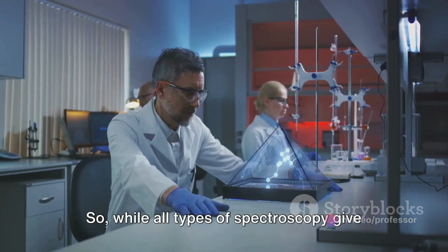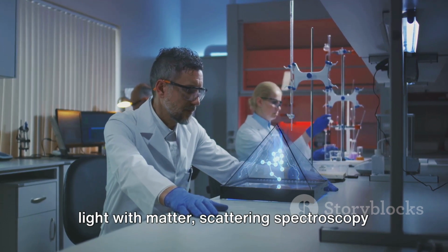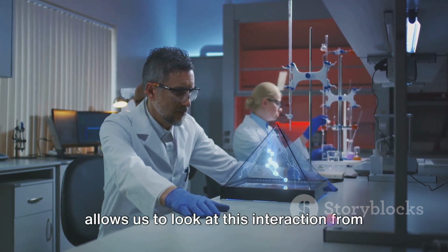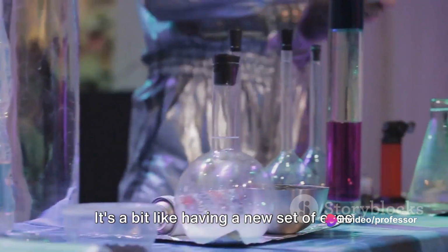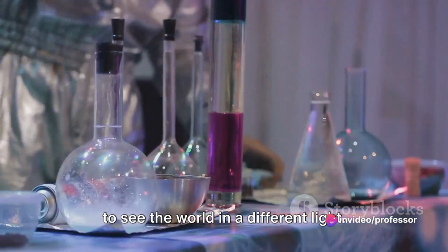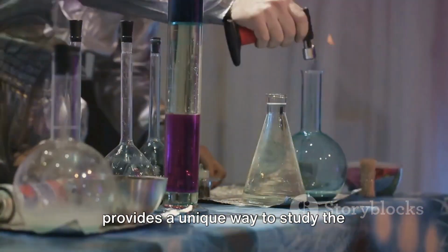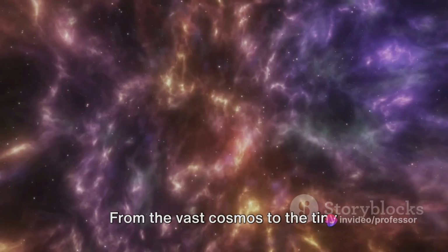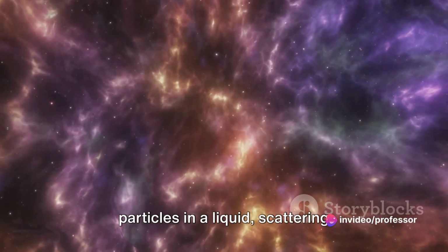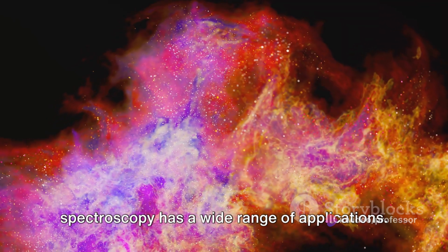So, while all types of spectroscopy give us information about the interaction of light with matter, scattering spectroscopy allows us to look at this interaction from a different angle. It's a bit like having a new set of eyes to see the world in a different light. Scattering spectroscopy, therefore, provides a unique way to study the properties of materials, even at a distance. From the vast cosmos to the tiny particles in a liquid, scattering spectroscopy has a wide range of applications.